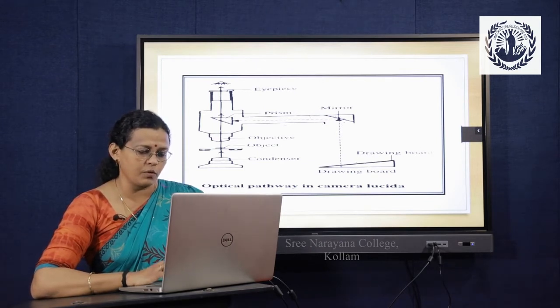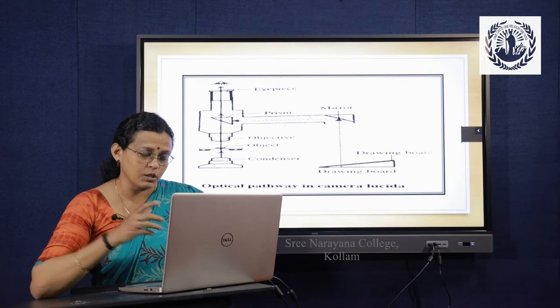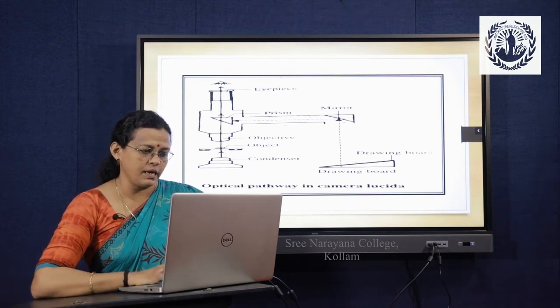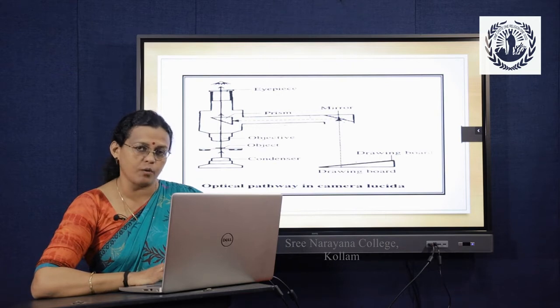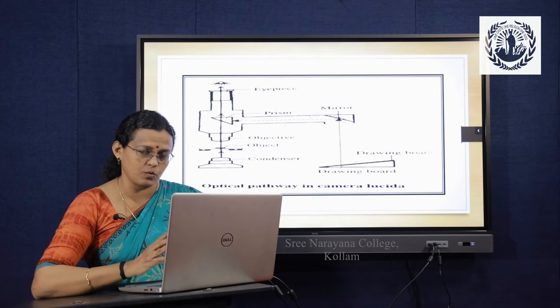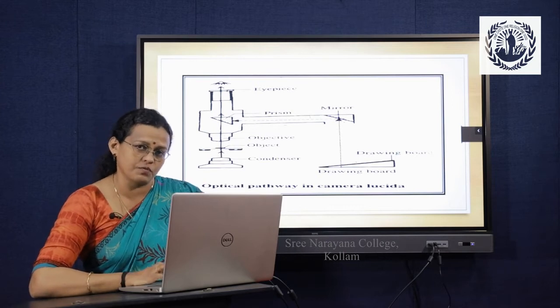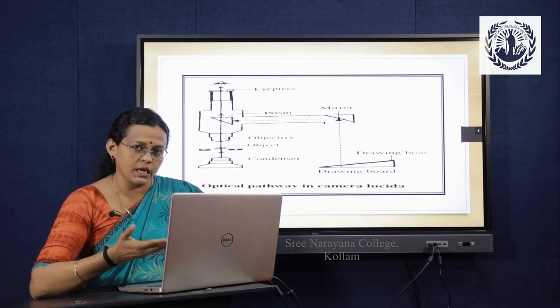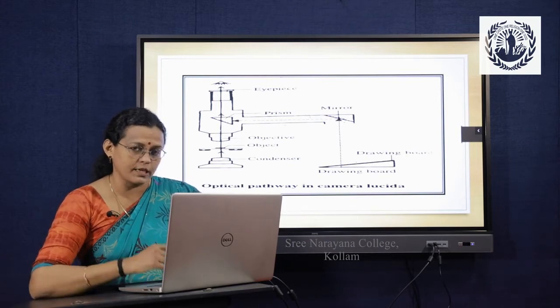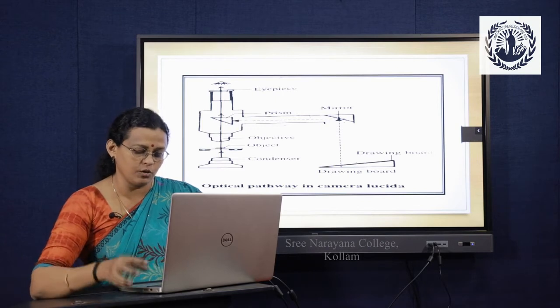So even if the white paper is kept beside the microscope, you can actually observe the white paper through the microscope. Then as usual we will be viewing the object also through the microscope. So it appears that the object is kept over the white paper. So you can actually do the tracing work, and it should be taken care that the white paper does not shift. Once you start drawing, the paper should not shift, so it has to be fastened while drawing. So you can observe that this material is on top of the white paper, on which you can easily draw.